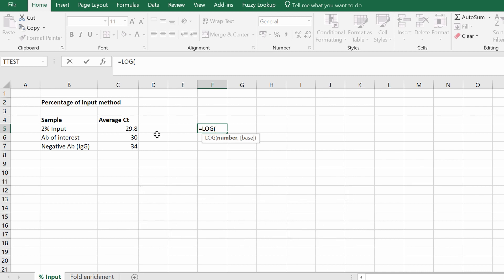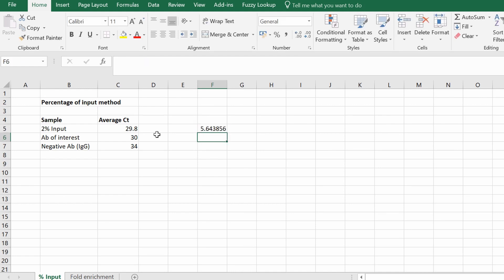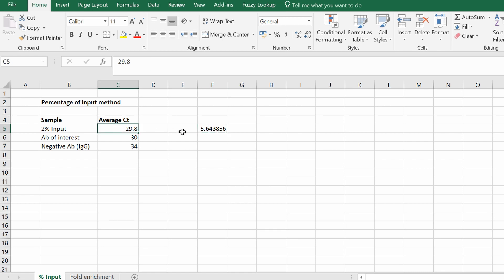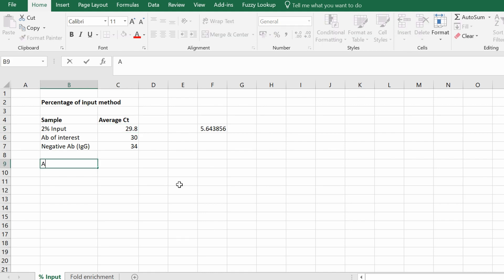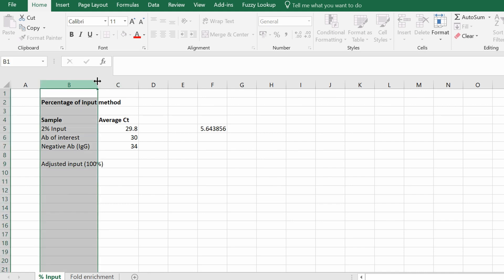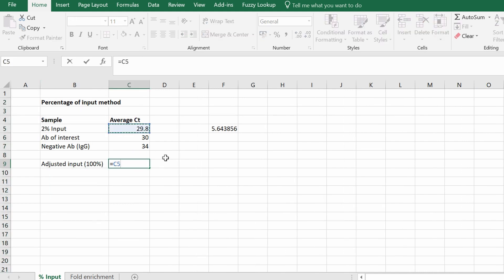In this example, since mine is a 2% input sample, I'm going to type: equals log, open bracket, 50, comma, 2, close bracket, then hit enter. This number represents the CT value we need to subtract from our 2% input sample CT value. I'll label the next cell 'adjusted input' — this will represent 100% input — and enter equals the input sample CT minus the number we've just calculated.